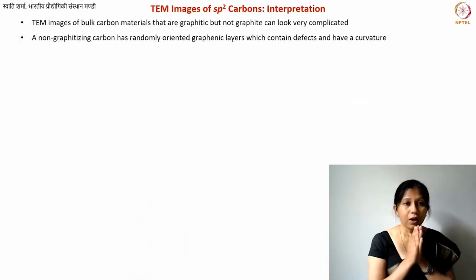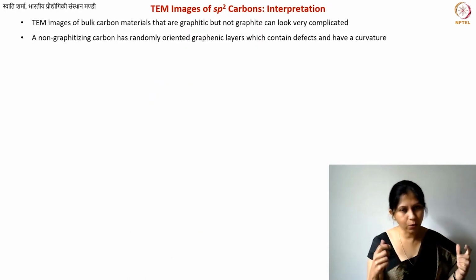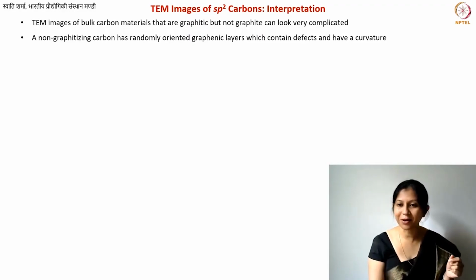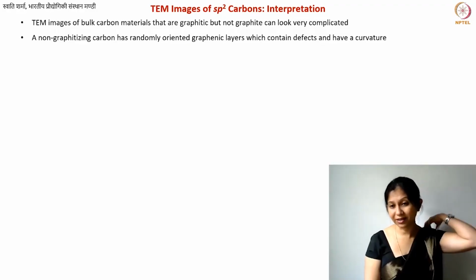So, TEM patterns of non-graphitizing carbons. What I have written here is graphitic but not graphite. These are the carbons that are most extensively studied, because they are important to us for a lot of manufacturing purposes, for a lot of device application purposes. So other than carbon nanomaterials, what you study the most is these non-graphitizing carbons.